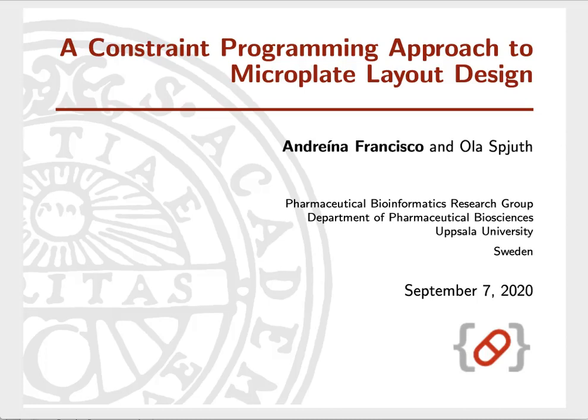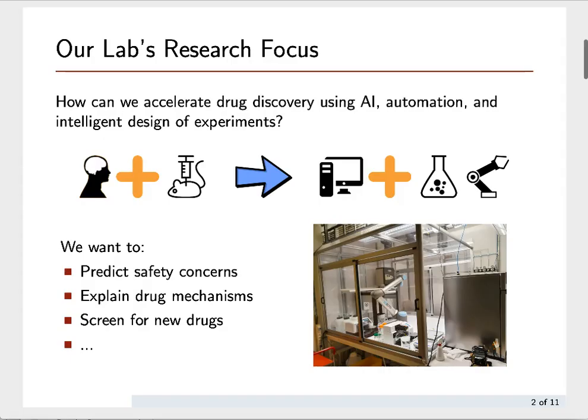Hi everyone! Today I'm going to talk about how we can use constraint programming to design microplate layouts. I'm currently part of a bioinformatics lab, which focuses on using artificial intelligence to develop systems that can aid with drug discovery. Laboratory work nowadays is mainly human-guided.